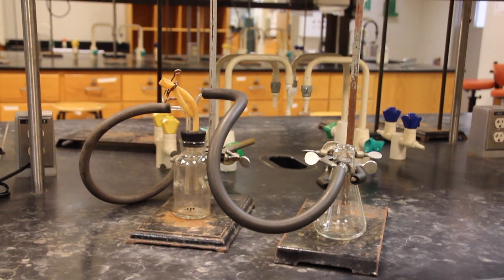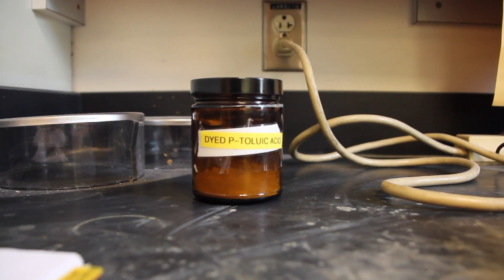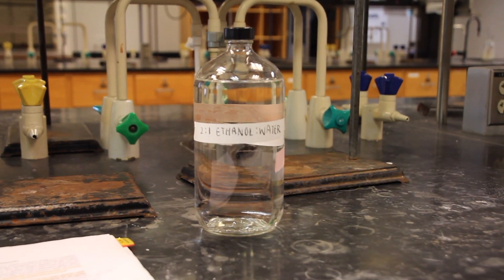You're going to begin this experiment by recrystallizing 0.5 grams of orange toluic acid using a 2 to 1 mixture of ethanol water.